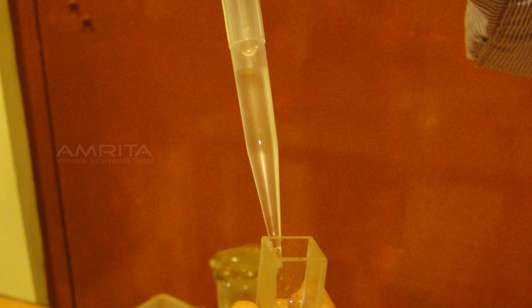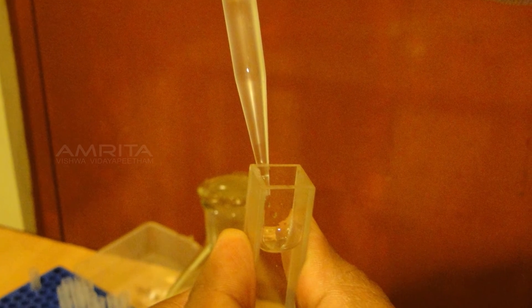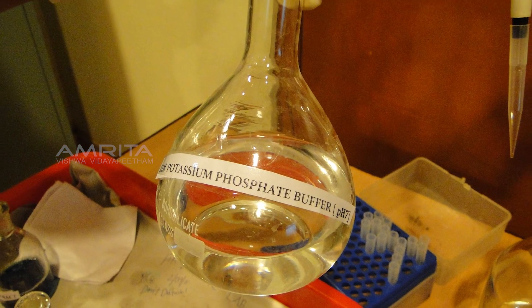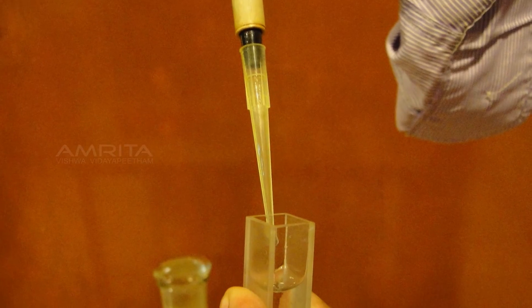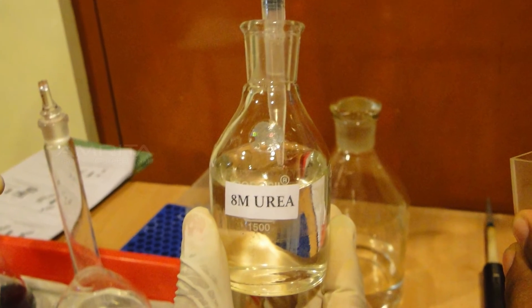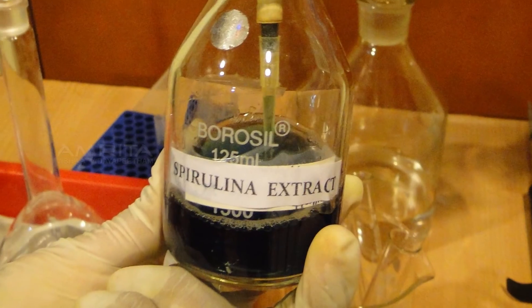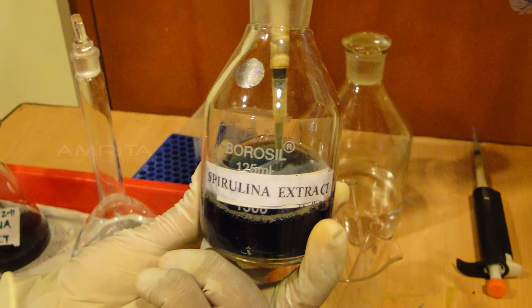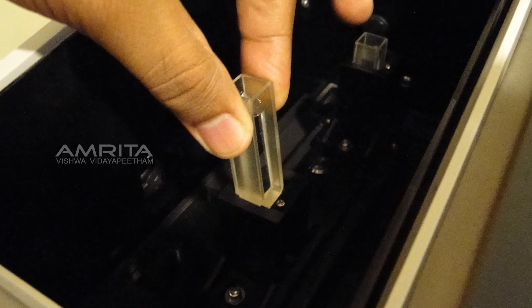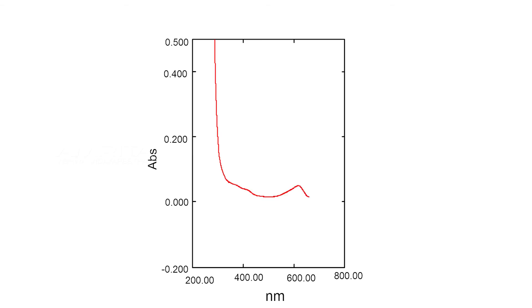The solution is then discarded and the cuvette is washed well and dried. Take 2.25ml of potassium phosphate buffer in a cuvette, then add 750µL of the second denaturant 8M urea. Finally transfer 100µL of protein solution to this cuvette, mix well using a pipette, and place the cuvettes in the UV spectrometer slots and record the spectrum at 625 nm.